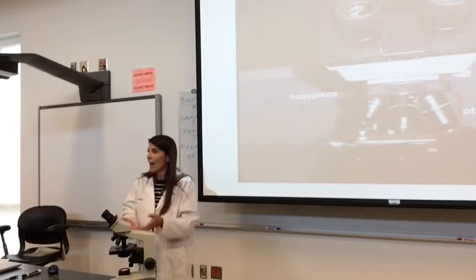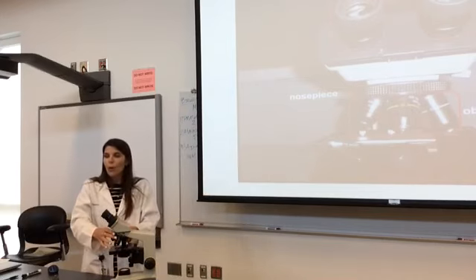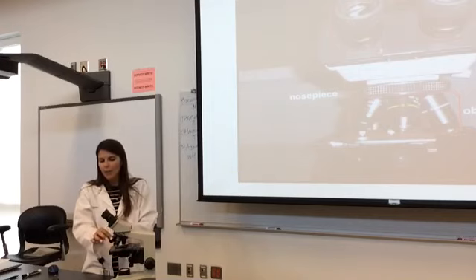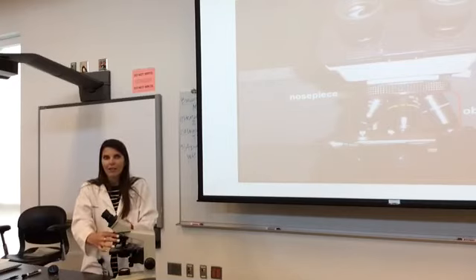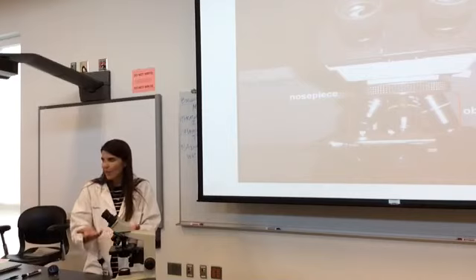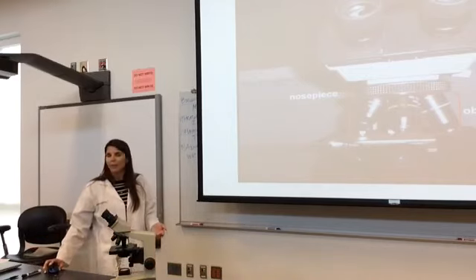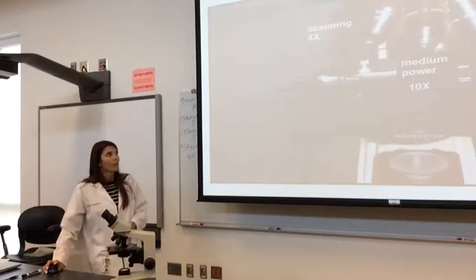It has you do this in the lab, but I wanted you to see it because it's something that people struggle with. Okay? So I wanted you to see that working distance. You know the magnification of each of the objectives because it's printed on there. So when you're taking your exam, your quiz, you can reference this. Like, it's not a trick. Like, if you know what you're looking for, you'll be just fine. Okay? Questions right now? All right?